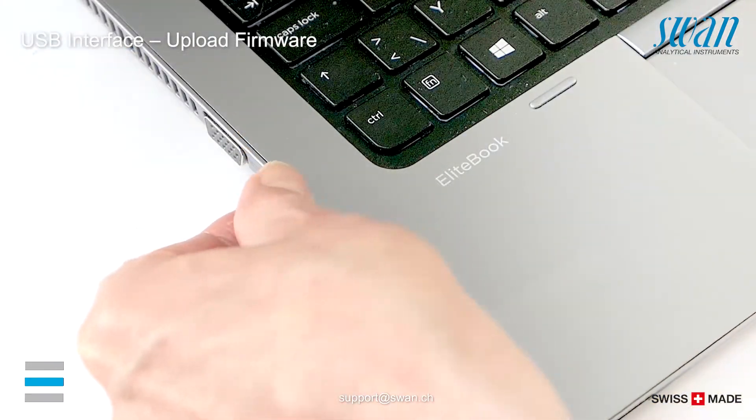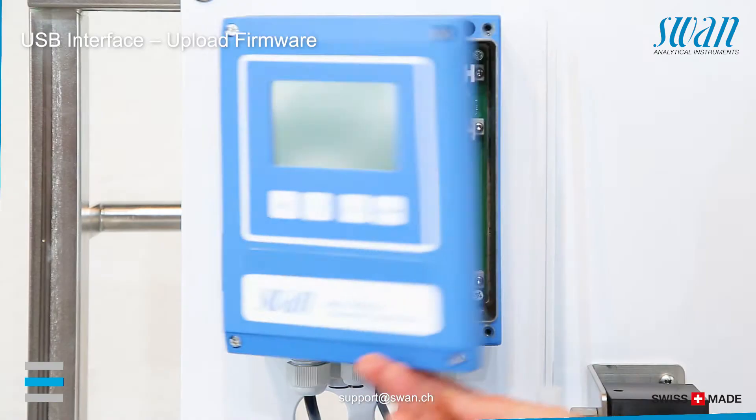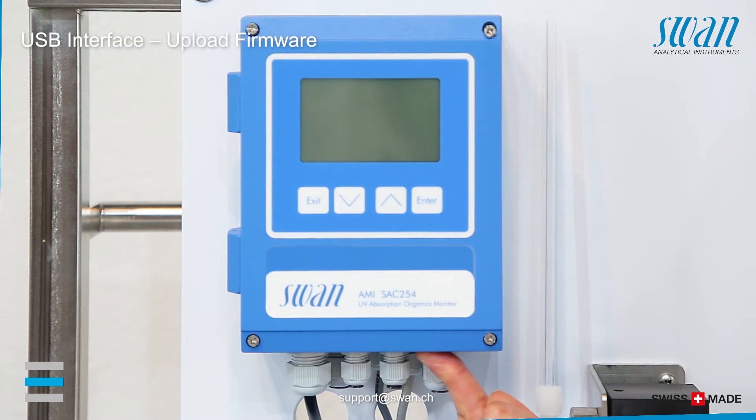Remove the USB stick and insert it into the USB interface. Close the transmitter housing and switch on the power.